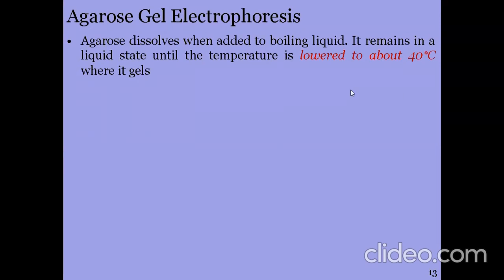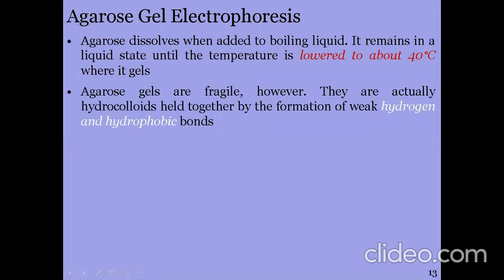Above 40 it will be dissolved in that liquid, but if we reduce the temperature, it will make gels.